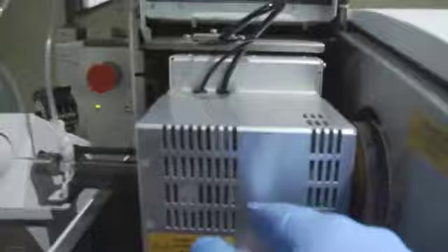This is a new pump system from Glass Expansion. It's called the Niagara Plus. This has been really working extremely well. It's a new sample introduction system that has a very short tube here going into the nebulizer. So it has a valve control cycling system that greatly reduces the amount of time that you need to spend in rinse cycles, which of course reduces the load on your sample cones in here, and also your plasma torch inside here. So it's some really sweet equipment. I'll probably do a review of that later.